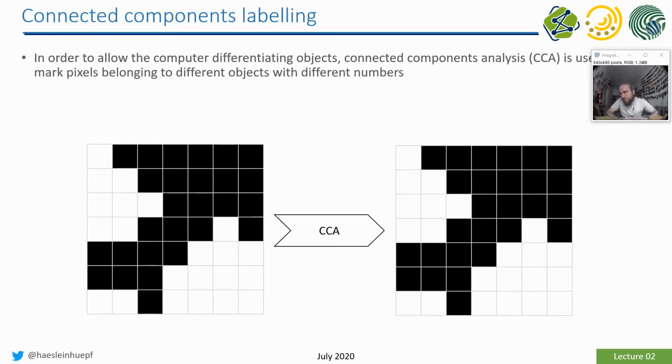It's just two terms used basically for the same thing. If you think very carefully about it, connected components analysis is finding out which pixels or which objects in the image are touching. And if you afterwards label these pixels according to which belong together, which are connected, then this is connected components labeling. But it is actually the same process which delivers finally a result of that kind.